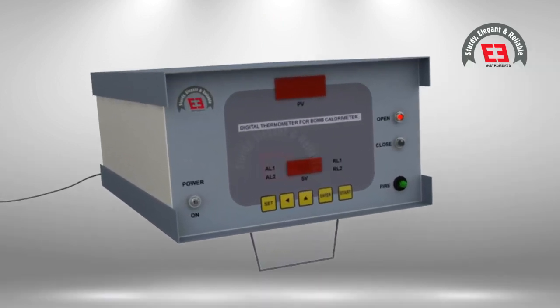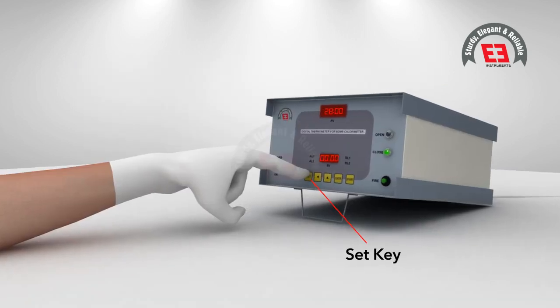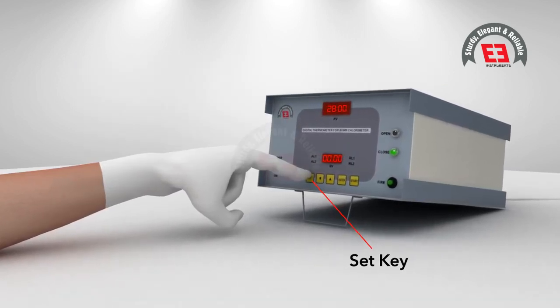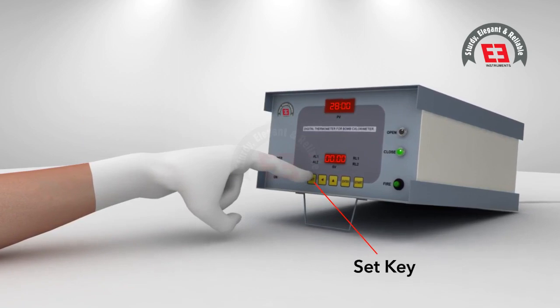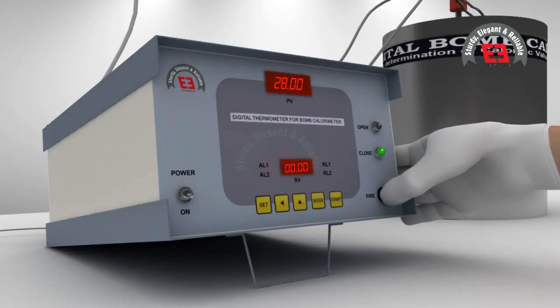Insert the temperature sensor of the digital temperature indicator. Turn on the panel of the firing unit and start the stirrer. Ensure the closed circuit of the ignition wire by observing the LED. Read the temperature on the display and allow it to stabilize for not less than 10 minutes. As soon as the temperature is stabilized and remains steady, press the set key and read the lower display showing 0.00 degrees Celsius. Note down the initial temperature T1 = 0.00 degrees Celsius.